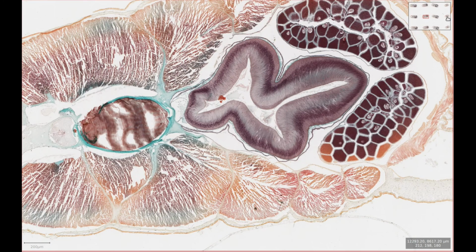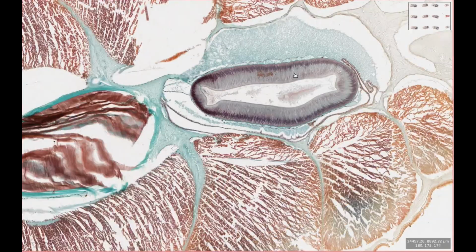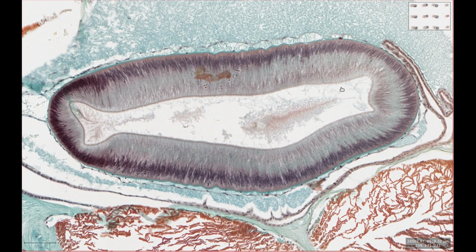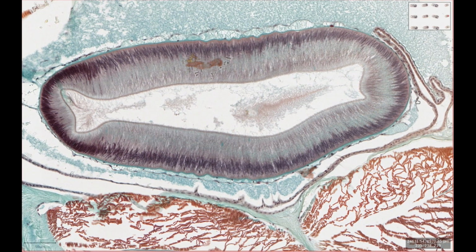So the last bit of gut that you can see, not very interesting, is the hindgut here. So this is just before, I guess you would call it, the anus. We've still got the atrium here, so this must be a little bit before the atriopore, where the water that's passed through the pharynx is going to finally be ejected from the Amphioxus. So it's pretty much exactly the same as the midgut. And I've not been able to find any details about any other functions or diverging function between the midgut and the hindgut. It's just not been studied yet.